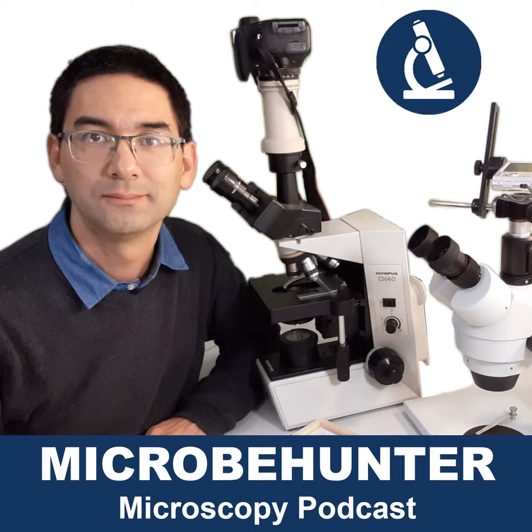So if you decide to go for an infinity system, if you have the budget, then do go for the large microscope manufacturers, okay? Because they are selling to universities and research institutes and all these. Their target group is different, and therefore they also have a larger stock of objectives available. So that is simply a short recommendation that I can make here. Ultimately that's pretty much it. That's all I wanted to say.